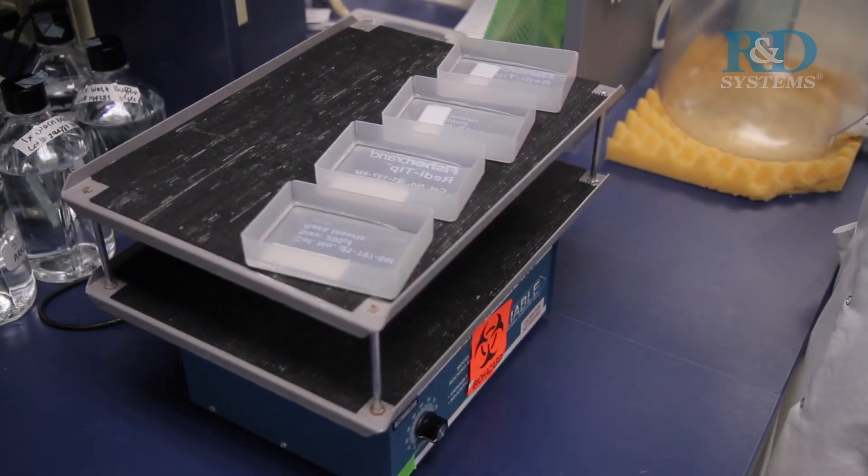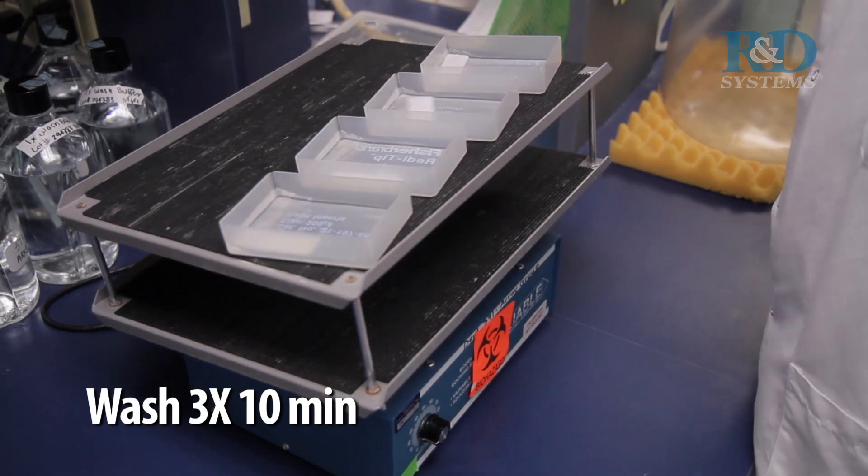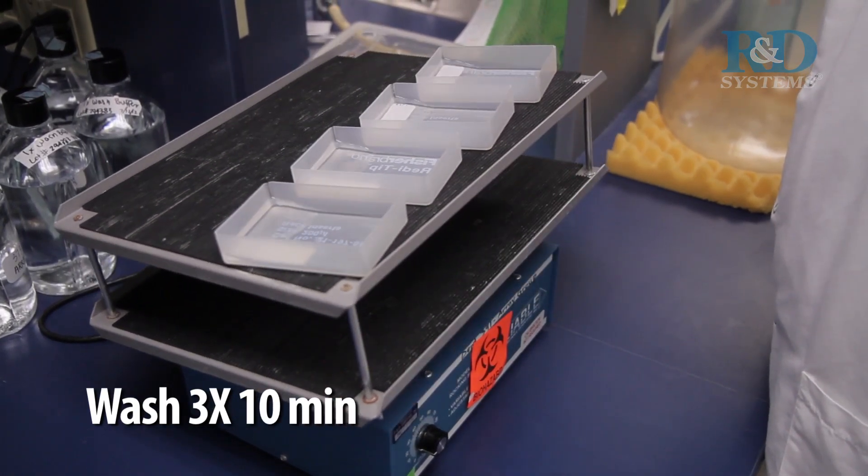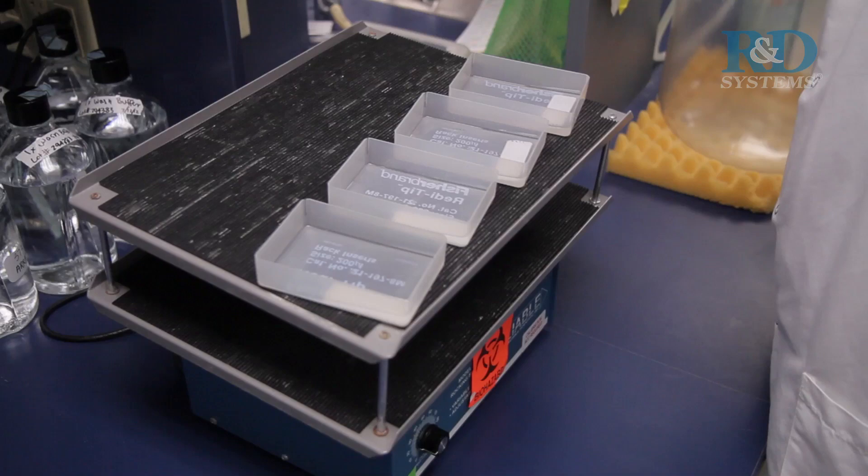Wash each membrane with 1x wash buffer for 10 minutes on a rocking platform shaker. Repeat 2 times for a total of 3 washes.